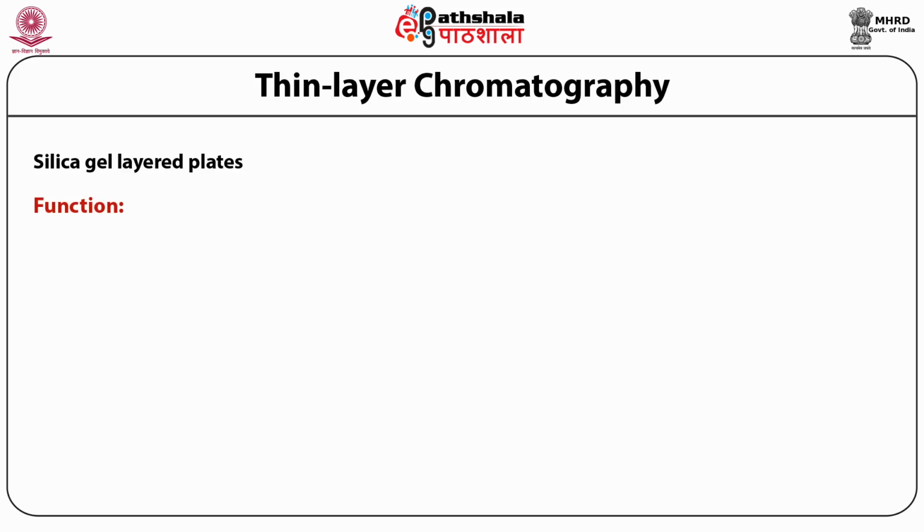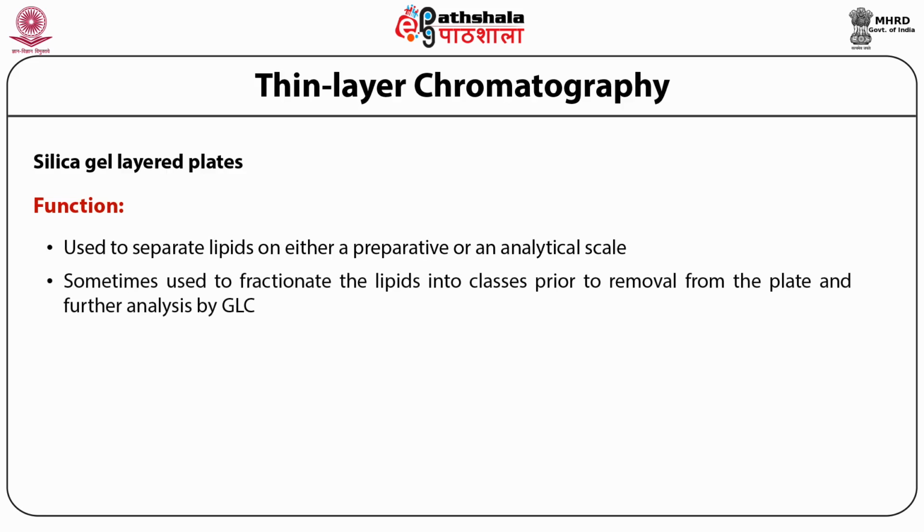The function of TLC is to separate lipids on either a preparative scale or on an analytical scale. Sometimes TLC is also used to fractionate the lipids into classes prior to removal from the plate and further analysis by gas liquid chromatography.